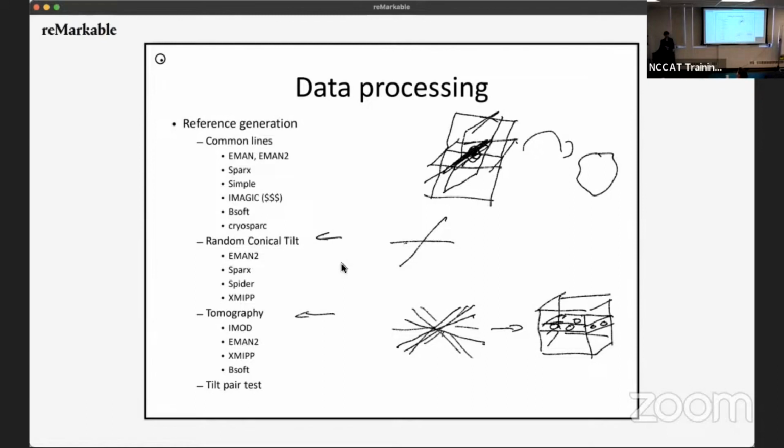And that reference can be very low resolution, that's fine, because usually you don't use higher than 30 angstrom resolution when you start aligning your particles anyway. So you need a reliable 30 angstrom resolution reconstruction. That's all you need. And so a few micrographs or a few fields of view, even potentially a single one, might be enough. Yes? Did you do it in cryo or just in native state?